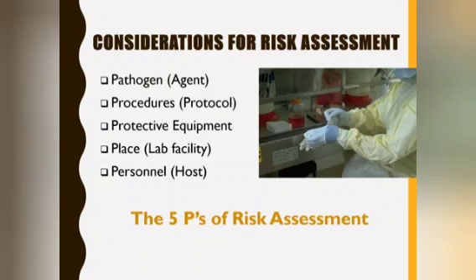The third is protective equipment, such as biosafety cabinets, sealed centrifuge rotors, transport containers, biomedical waste containers, and personal protective equipment. Are all the equipment to be used operational and functioning properly? And are you trained to use it correctly?